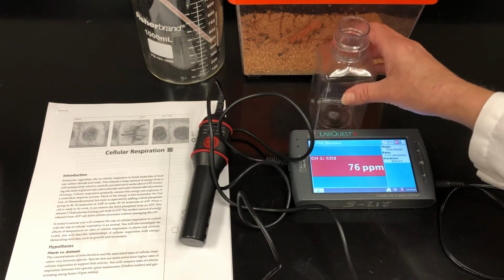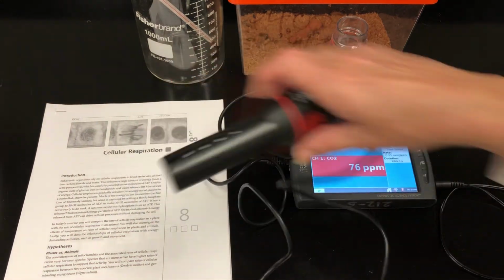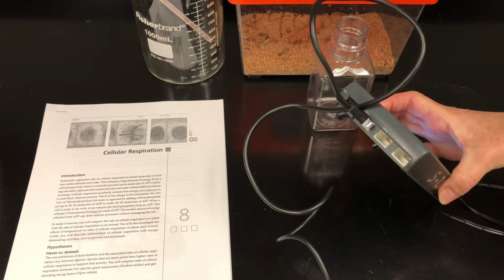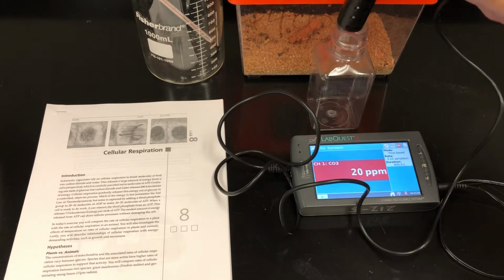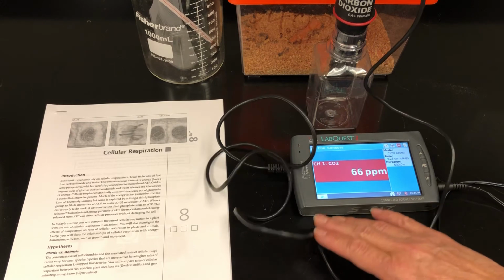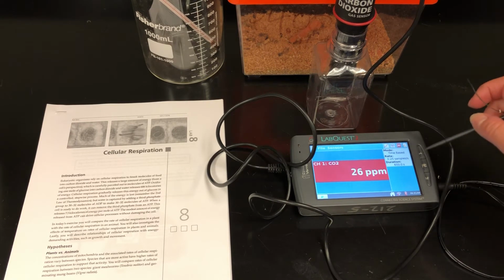We know what the mass of each one of these Nalgene bottles is, so that once we put our organism in there, we can weigh it so we know the mass of the organism. And then I've already got my sensor connected to my LabQuest unit. Then you just insert the sensor into the unit, and I'm going to program the mode, the rate, and the duration. We're going to run this experiment for 30 minutes.